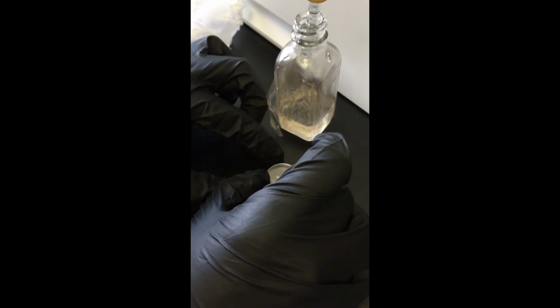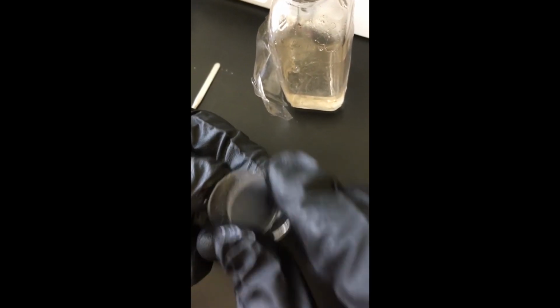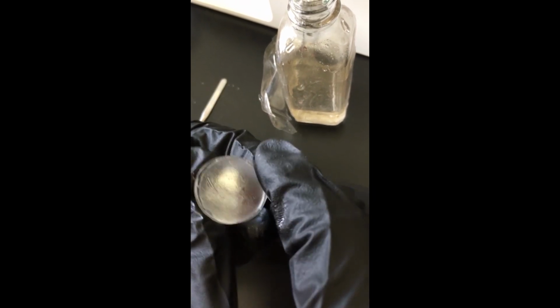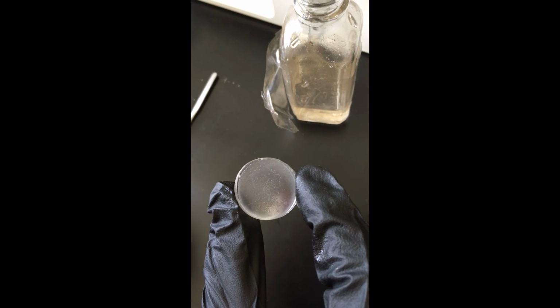I'll go ahead and take this and just grind these together. So we've got our crystals nice and suspended. And we'll go ahead and take that and run an IR.